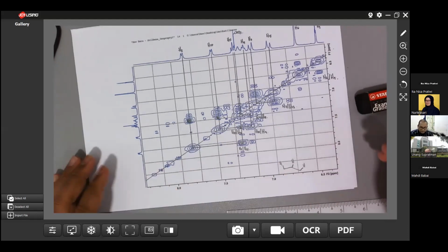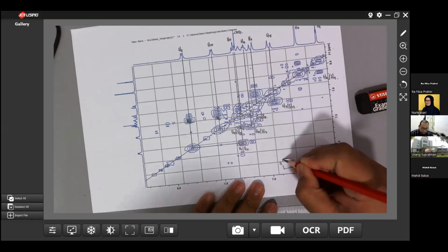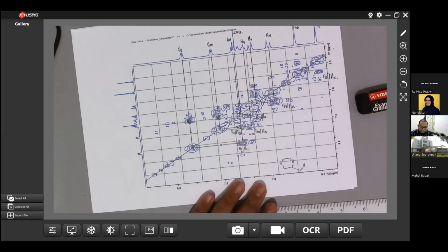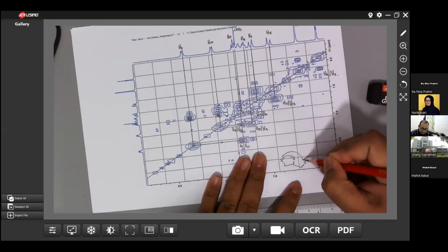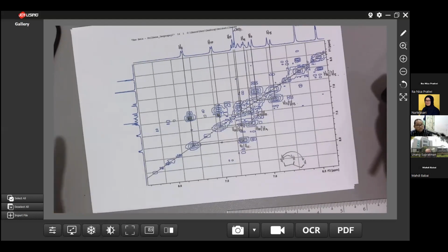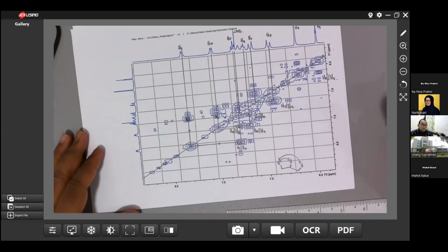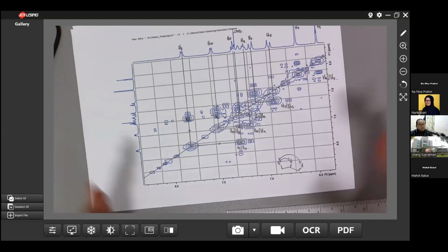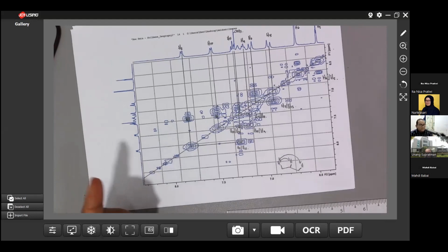Normally we can see only this proton in theory, but sometimes you can also see this proton, depending on the nature of your compound. Sometimes we call it long-range coupling, so you have to be prepared. That's why anybody doing protein chemistry loves to use a high magnetic field, because they can see the sequence.